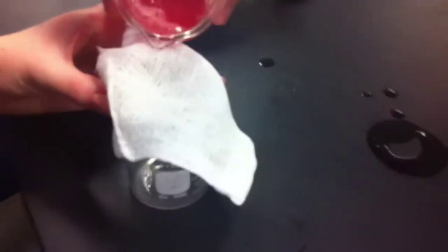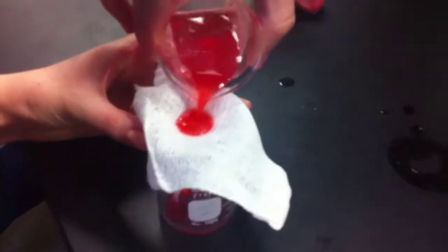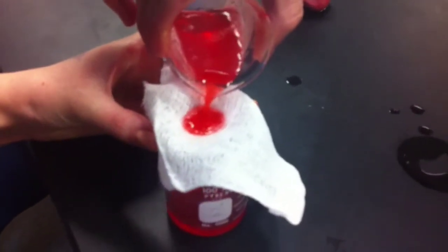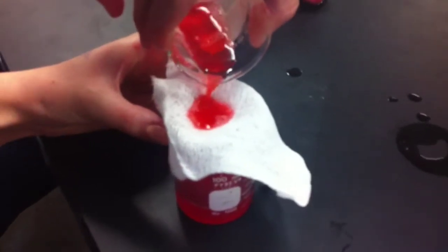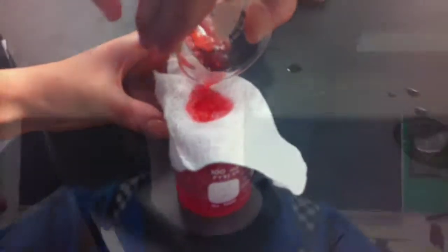So now we're going to put the cheesecloth on top of the beaker and pour the solution we've just made into the cheesecloth, which hopefully separates all the big chunks. Once we passed the homogenized mixture through the cheesecloth, we got a nice clear solution.